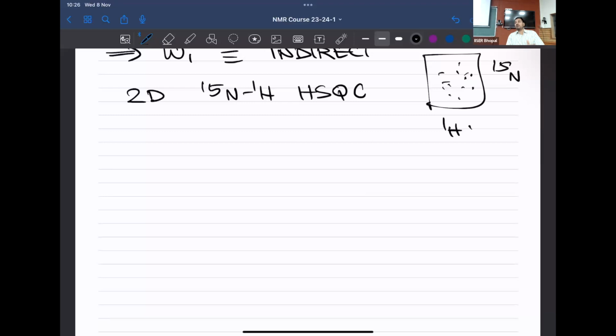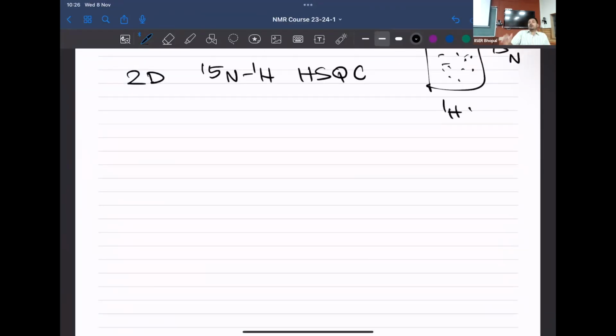As the size of the protein also increases, we will be able to see too many peaks come up for a very large protein system. You remember that, right? So you're able to understand that as the overlap starts to increase, you need to have other dimensions in order to make sure you will be able to get the spectrum correctly determined. And therefore, once you determine the spectrum, you have the analysis going. Once you have the analysis, you have a specific peak assigned for the different residues that are present.